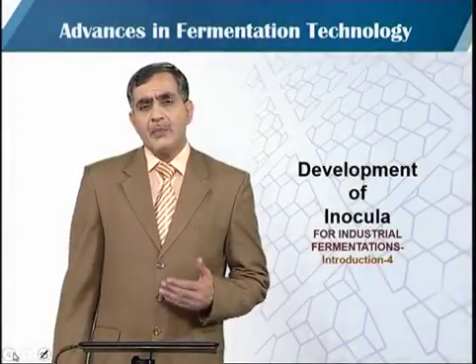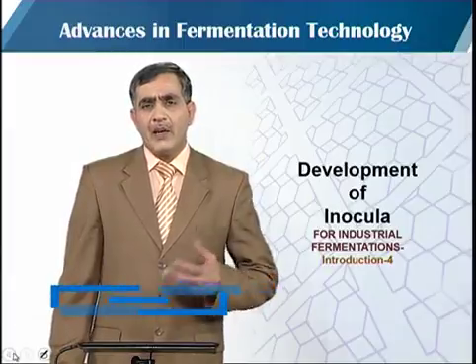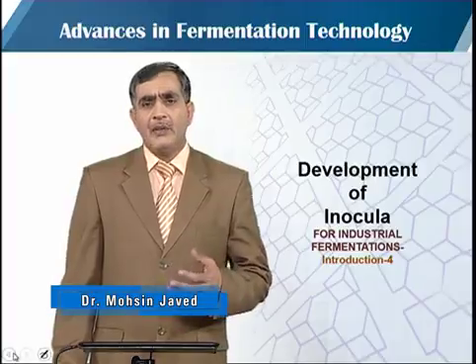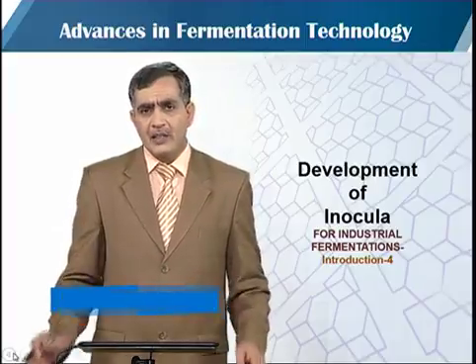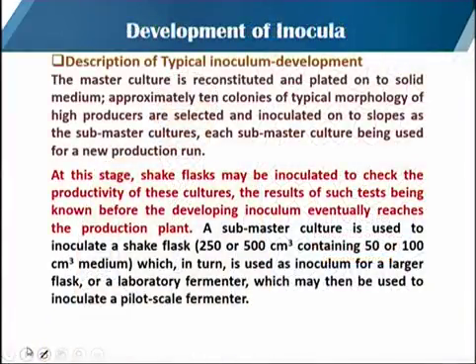As we have seen in our previous module, the importance of the inoculum, the level of the inoculum, the morphological form of the inoculum, and even the amount of the inoculum that is required for industrial fermentation. But in this module, we will talk about the inoculum development procedure.